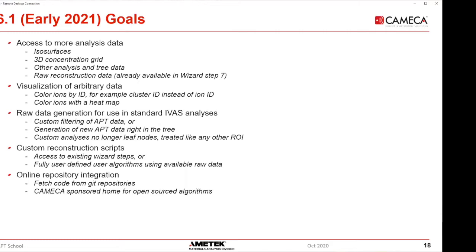So that's where it'll be in GitHub, I assume, and people will be able to give us pull requests, or you can also from within APSuite link to any Git repository at all, your own repositories or somebody else's repositories, and be able to automatically get and hopefully build, if you have the right tools installed, code from the web.